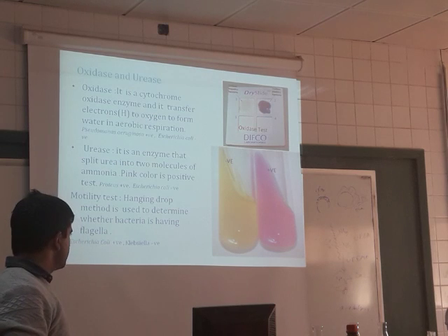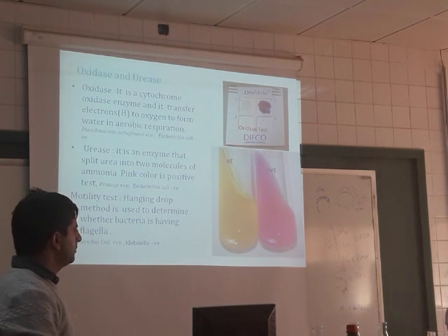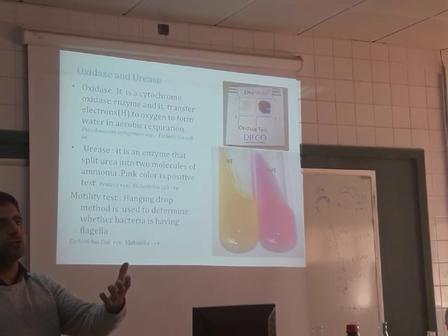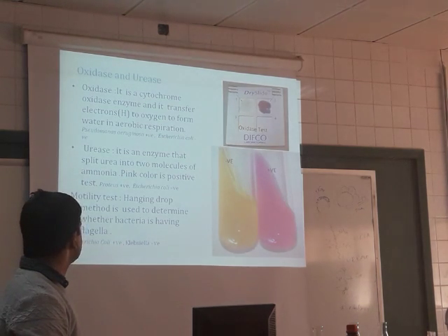Motility test is very simple. It shows whether bacteria have flagella or not. But it should be done here. You remember the hanging drop. The purpose of a motility test is to see whether bacteria have flagella and are moving or not.